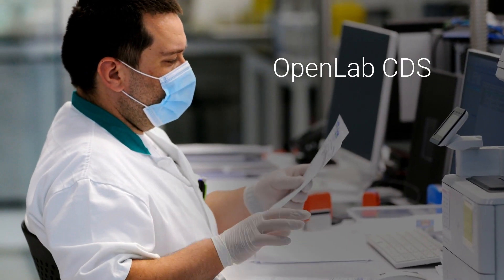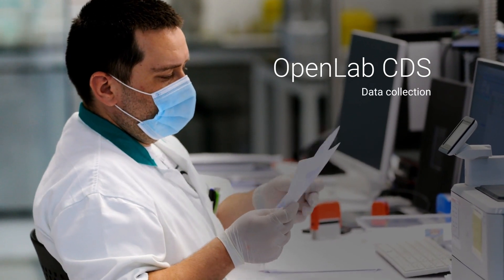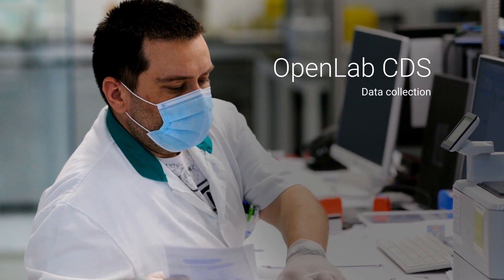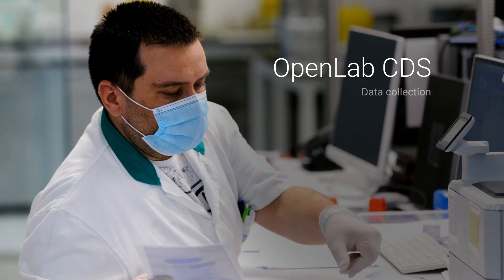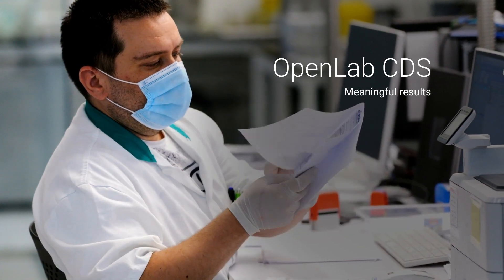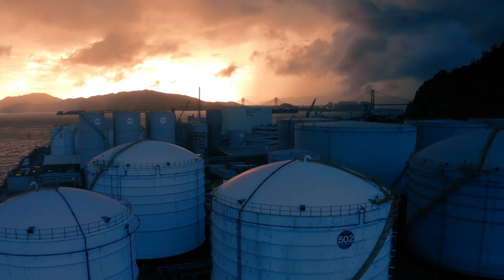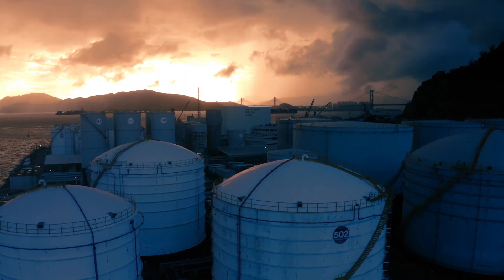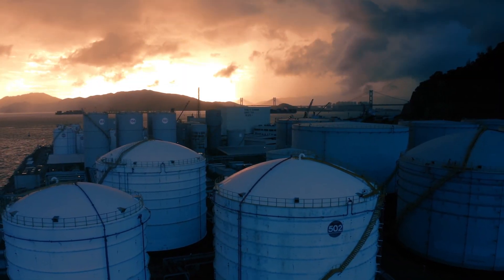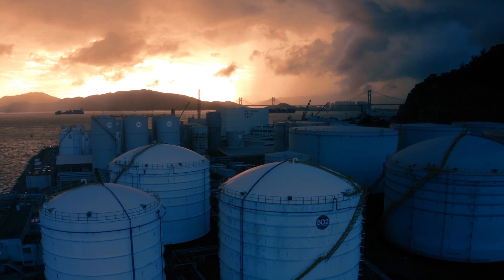Agilent OpenLab CDS streamlines repetitive and time-consuming tasks in the lab to keep it productive. To help energy and chemical labs like yours run efficiently, we're continuously adding advanced features that accommodate your unique workflows.